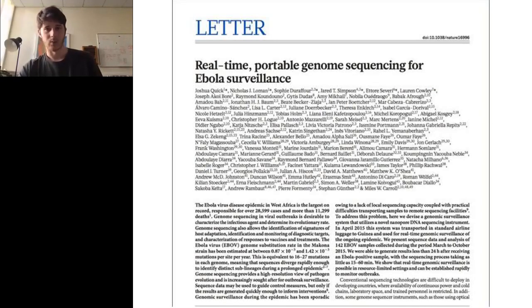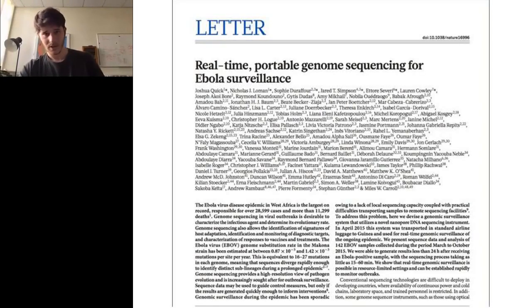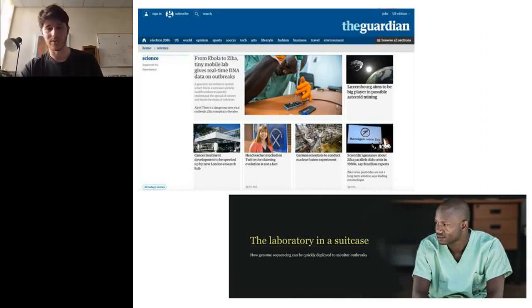So this work was all published by our group, along with nearly 100 collaborators as a Nature letter, as the first time that portable genome sequencing had been used for surveillance of an epidemic. And these are some of the press stories that were written on the article.